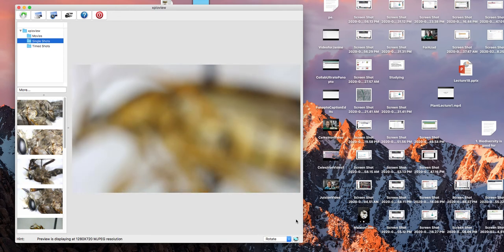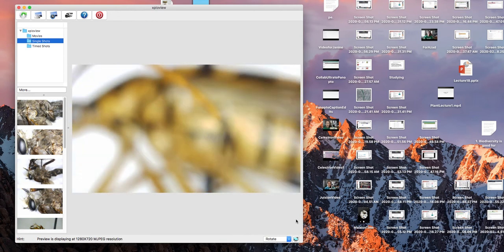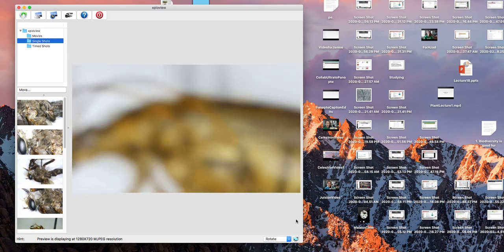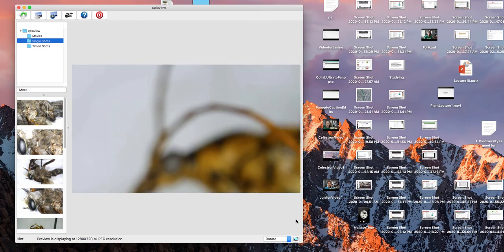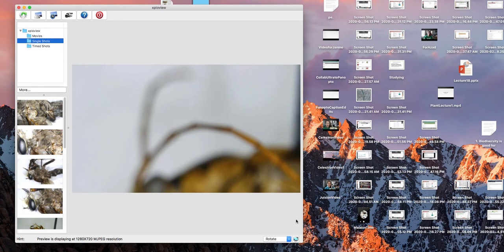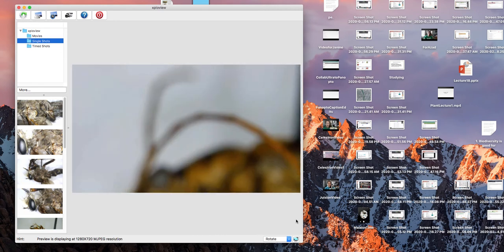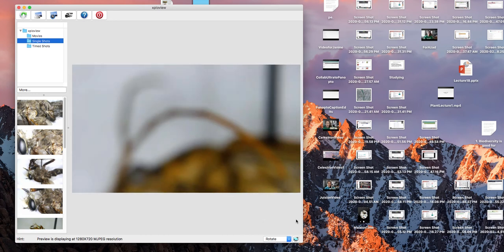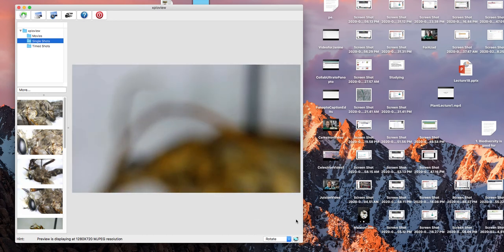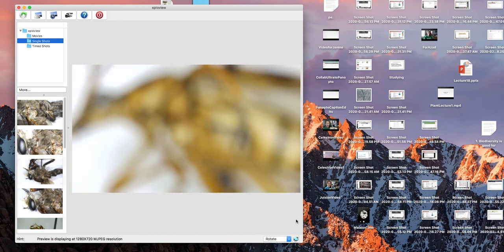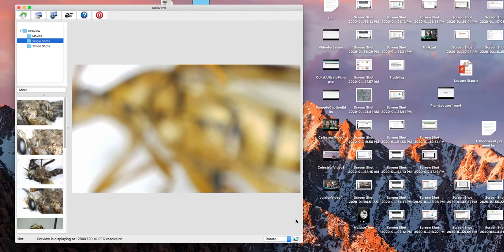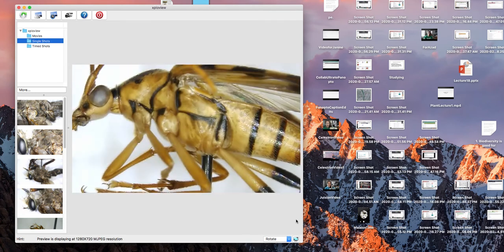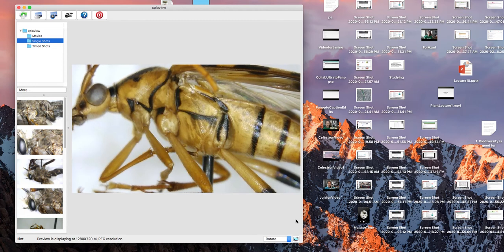Let's see if I can get as close as I can to this thing. You see right there I'm bumping into the clay. So I'm going to have to manipulate this a little bit. And now I'm running into the actual pin itself. This is probably as close as I can get for now without some serious playing around or removing where this insect is on the pin. We can bring it into focus. And yeah, it's pretty good.